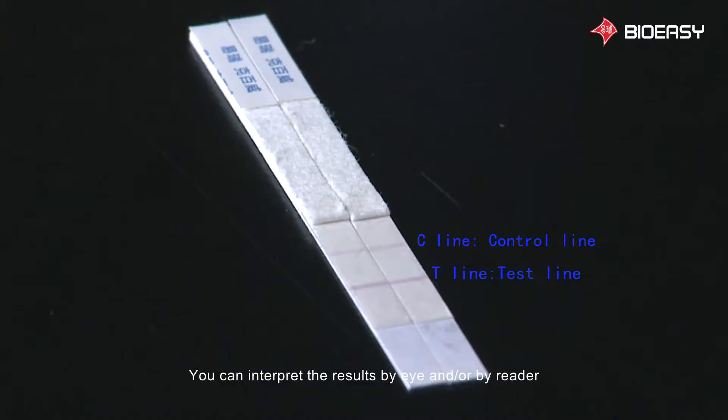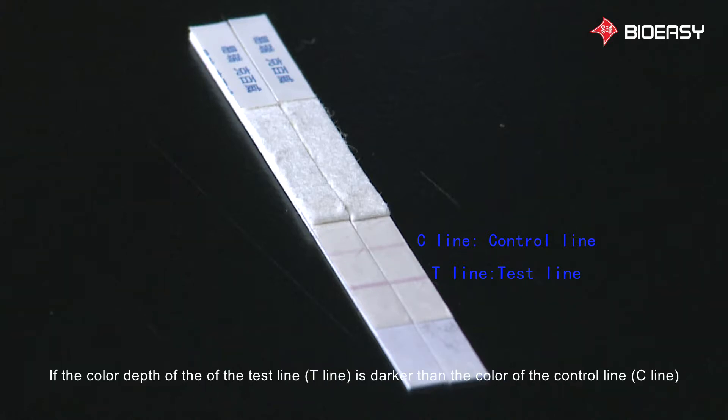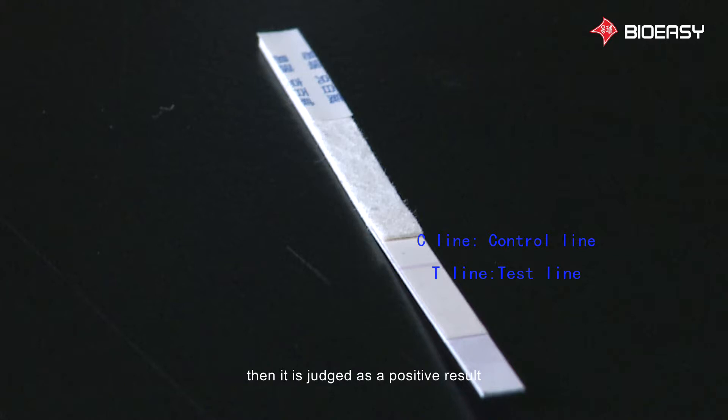You can interpret the results by eye and/or by reader. Interpretation by eye: look at the control line (C line) and observe if the color appears. If there is no color, then there was a reagent failure. If the color depth of the test line (T line) is darker than or equivalent to the color of the control line (C line), then it is judged as a negative result. If the color depth of the T line is less than the color of the C line, or the color does not appear, then it is judged as a positive result.